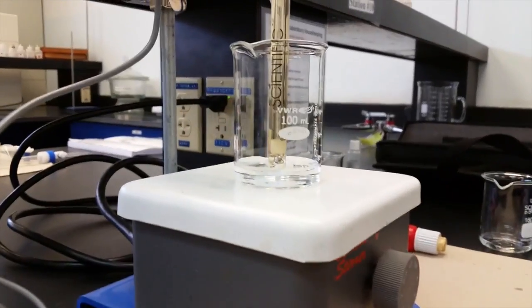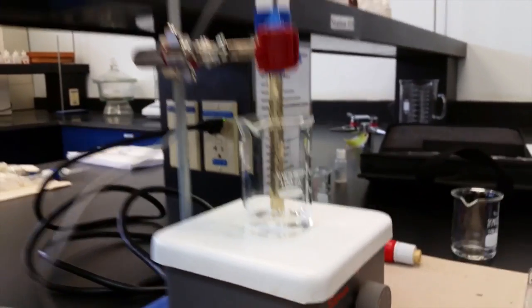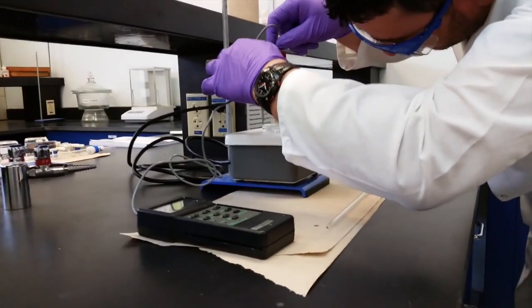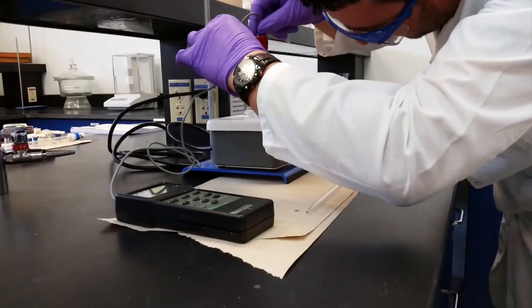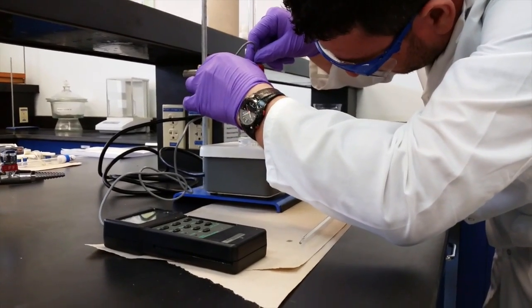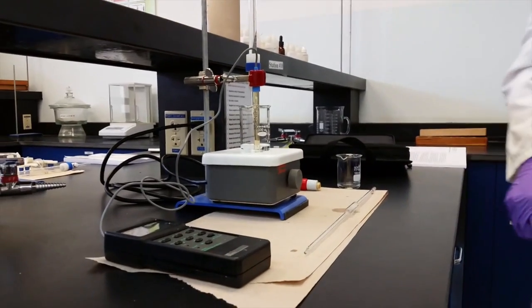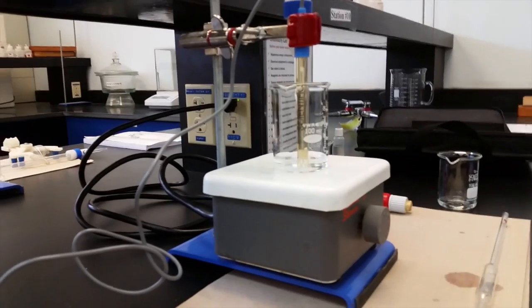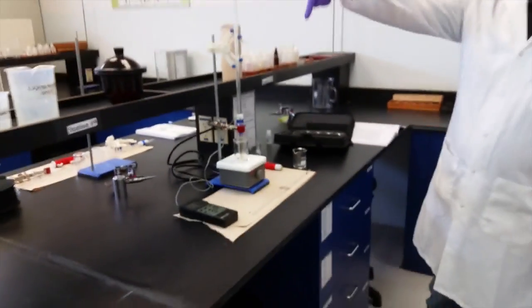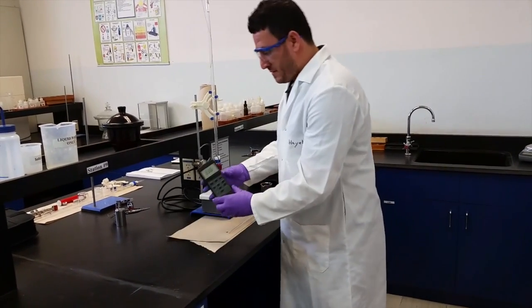The probe is not touching the acid. Okay, you can either bring it down, which I will try to do, and make sure that the magnetic bar doesn't hit it, or add some water, which is fine.